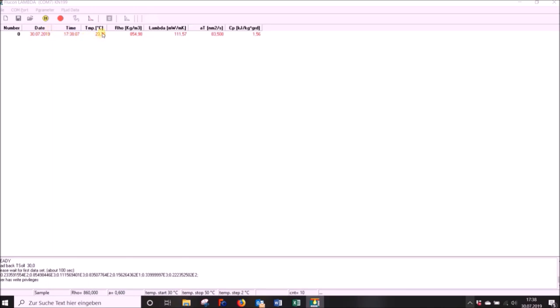Notice that the bottom of the program window has a status line, which not only includes information about your system, COM port, and measuring mode, but also the temperature settings.